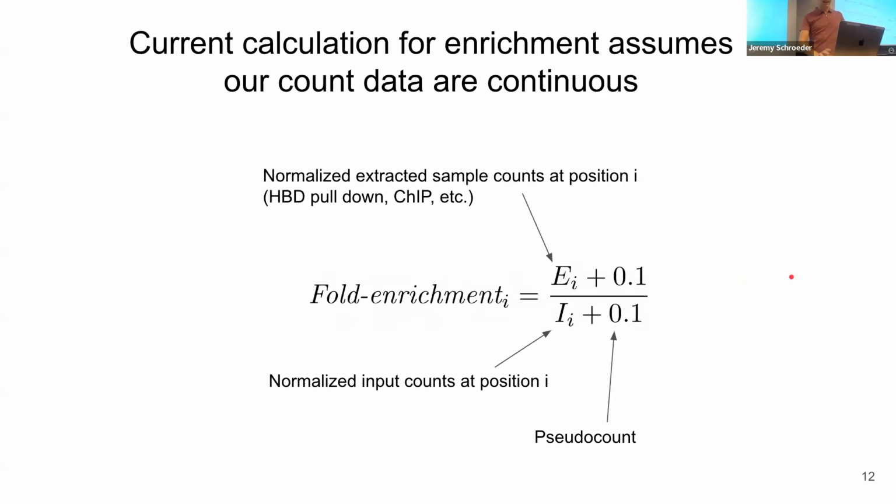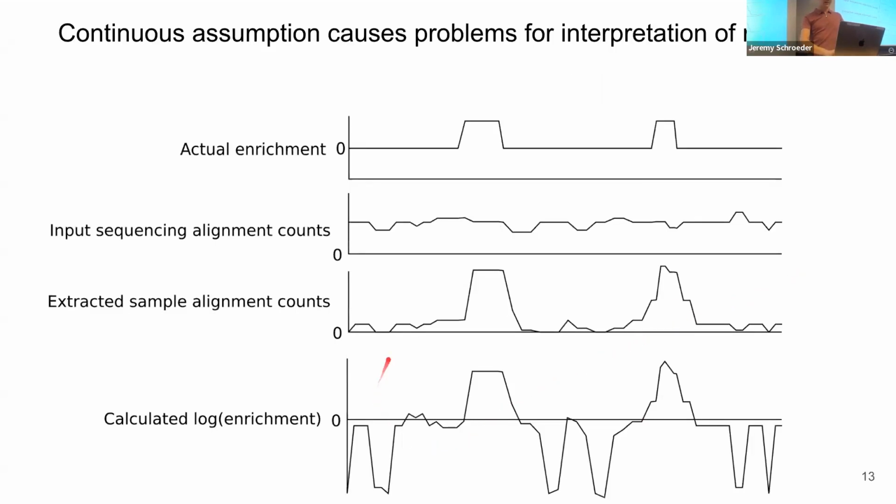All right, so we do that. And what results is that in these regions where we get 0 coverage in our ChIP-seq data set, when we take the log scaled enrichment using continuous math the way we did, we absolutely just get these strong negative spikes. So again, this comes from a couple of things. We're using math that's not really appropriate to the problem. And also, we are not sharing information between local nearby positions of the genome.